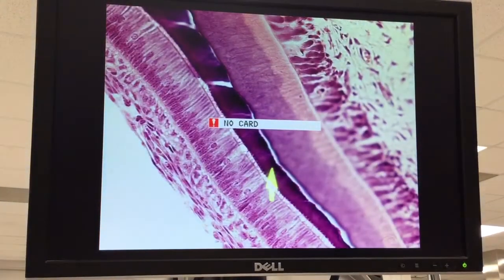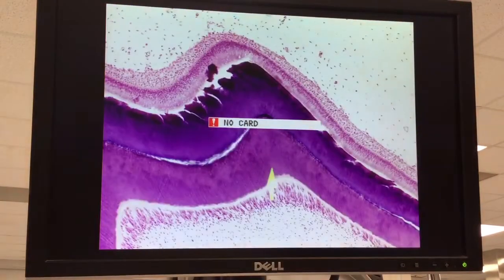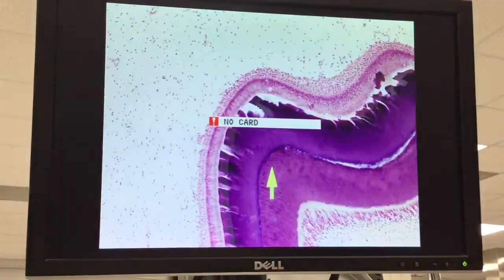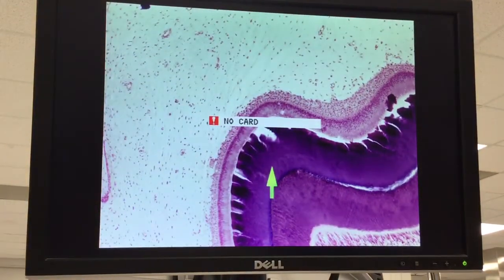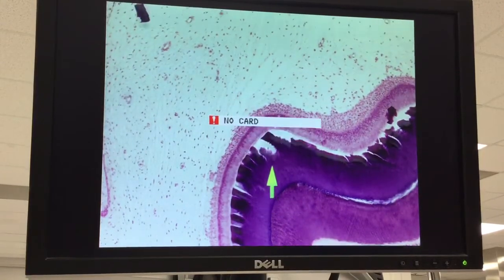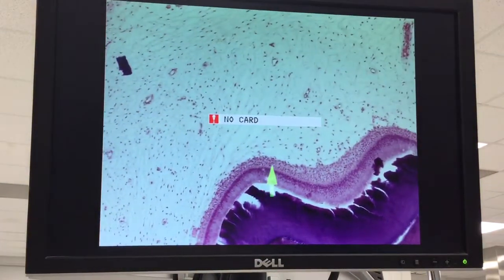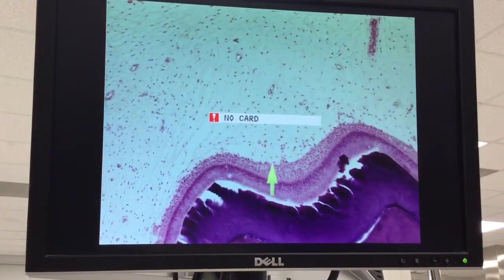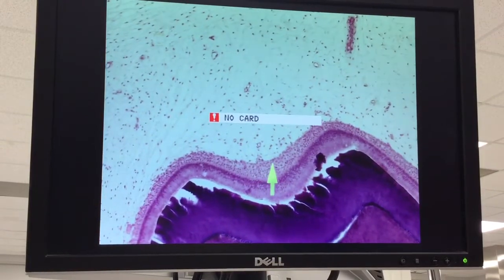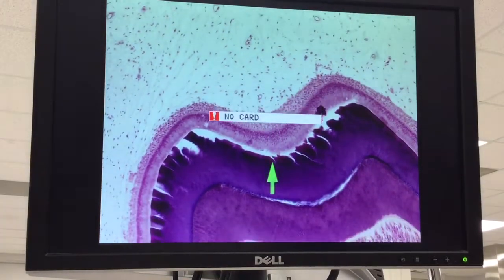And as we follow this up, we see the enamel is thicker up there. It's next to the cusps. And we have that reduced enamel epithelium completely covering that enamel organ.